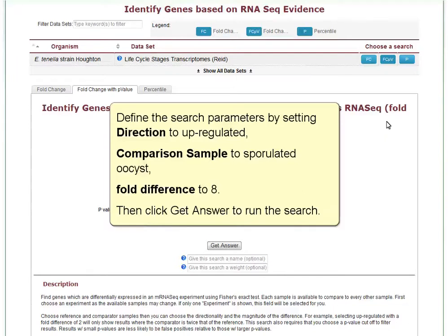Define the search parameters by setting direction to upregulated, comparison sample to sporulated oocysts, and fold difference to eight. Then click Get Answer to run the search.